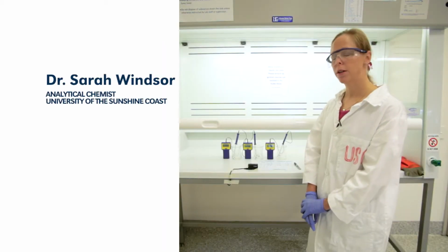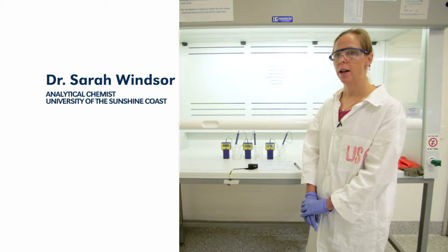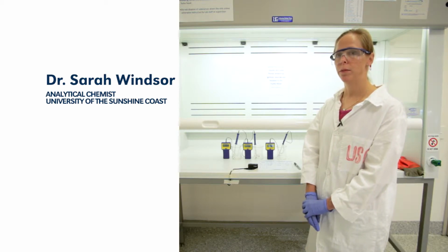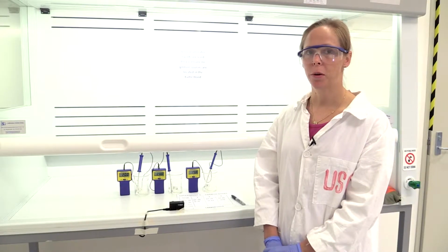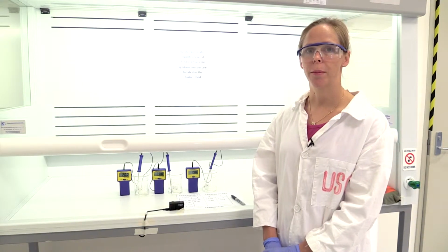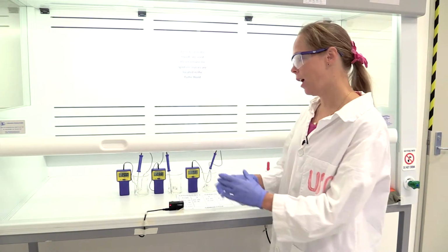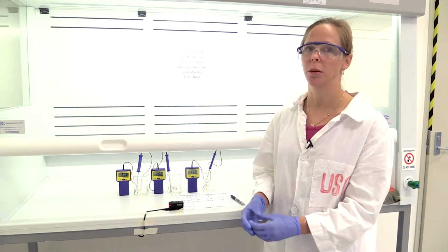So this is Carbon Cycle Reaction 1, and it's an artificial simulation of the production of coal. It takes 250 million years to form coal naturally, but today it'll take approximately 5 minutes for us to form coal.